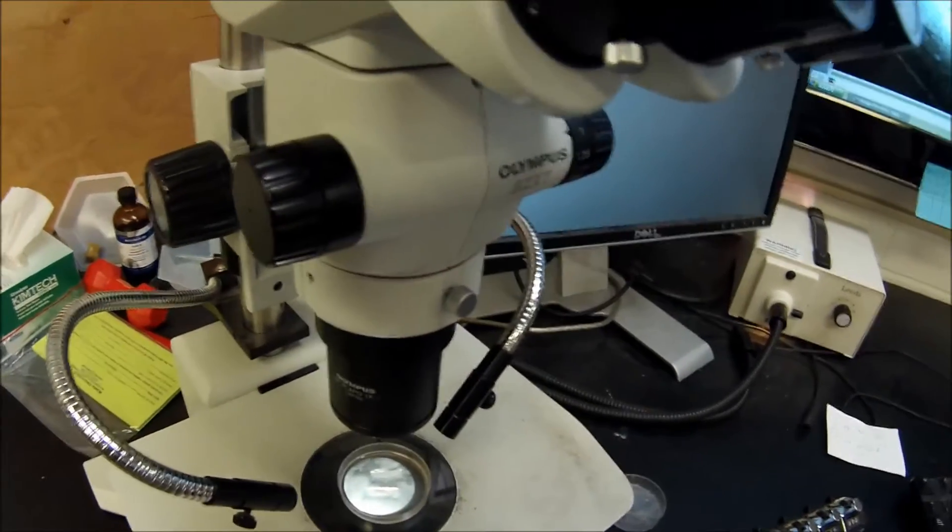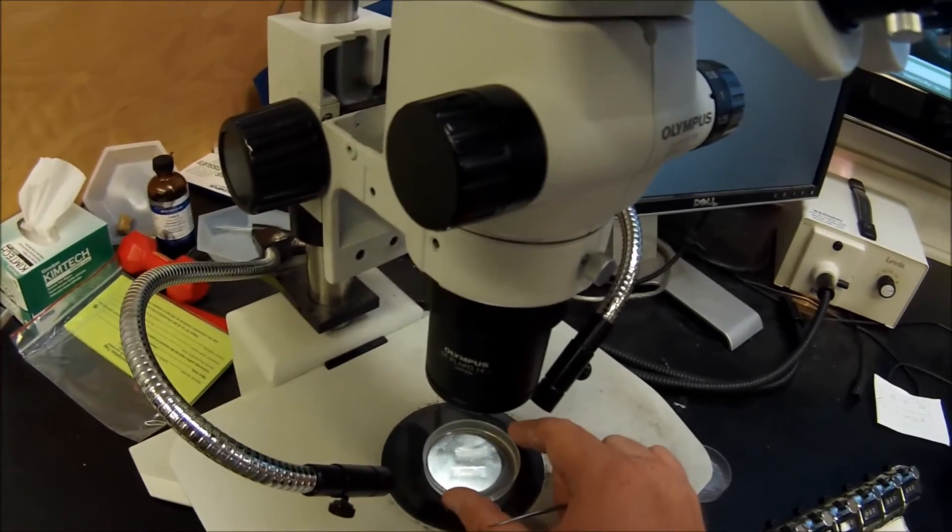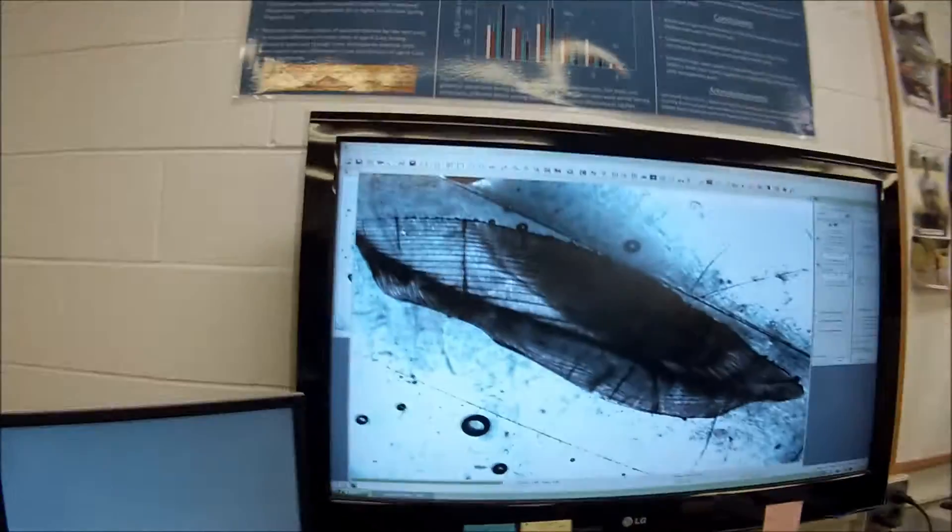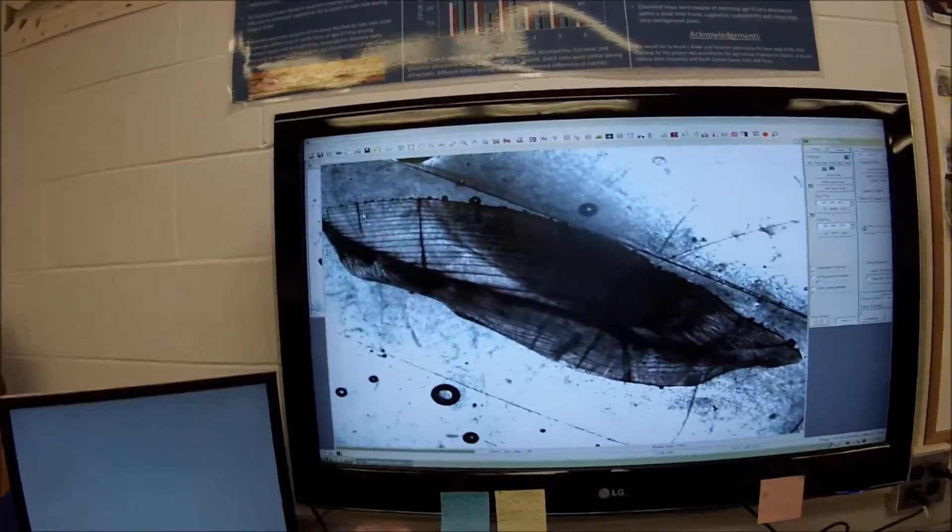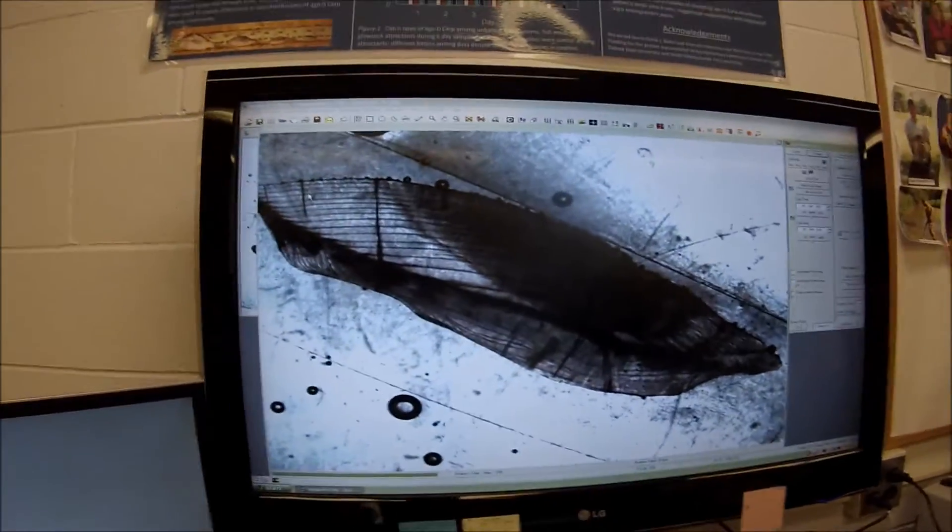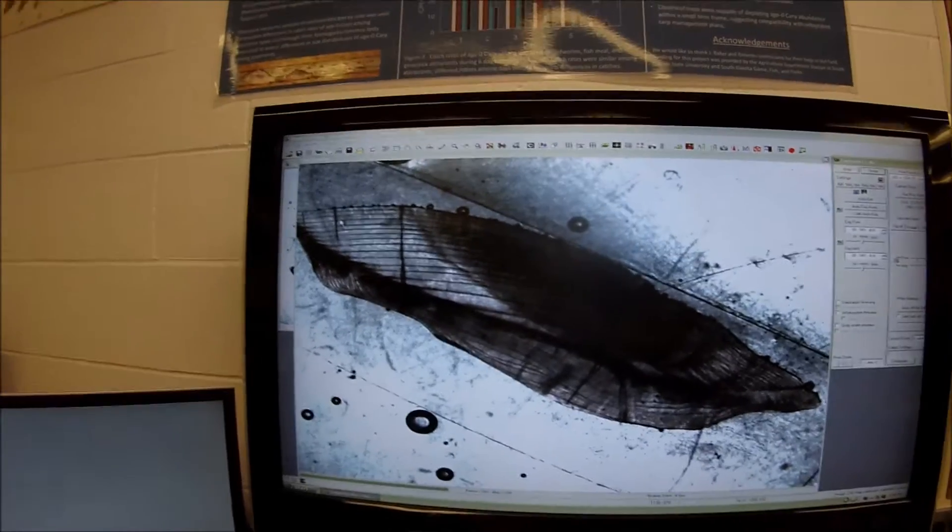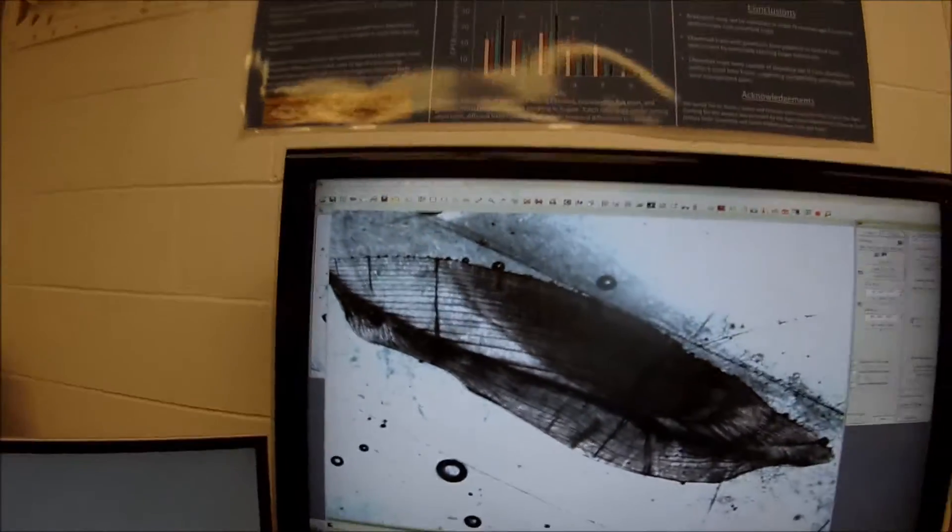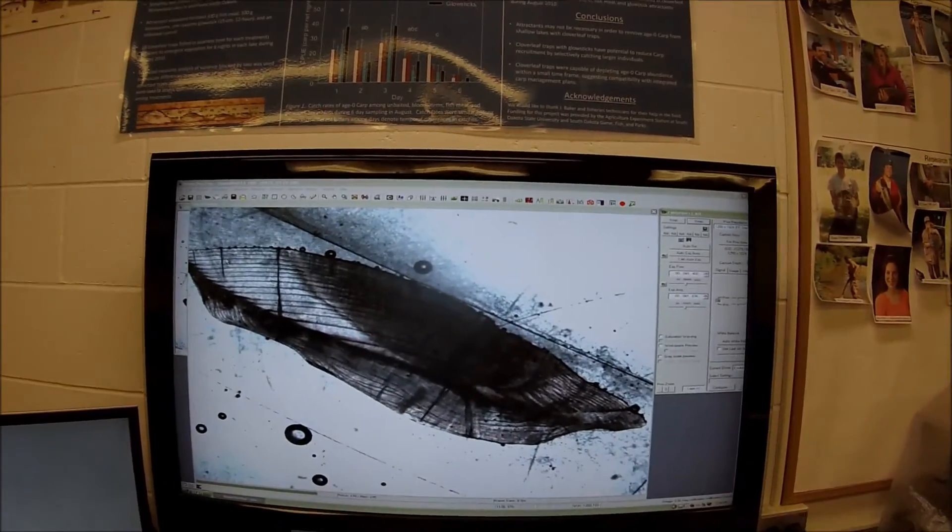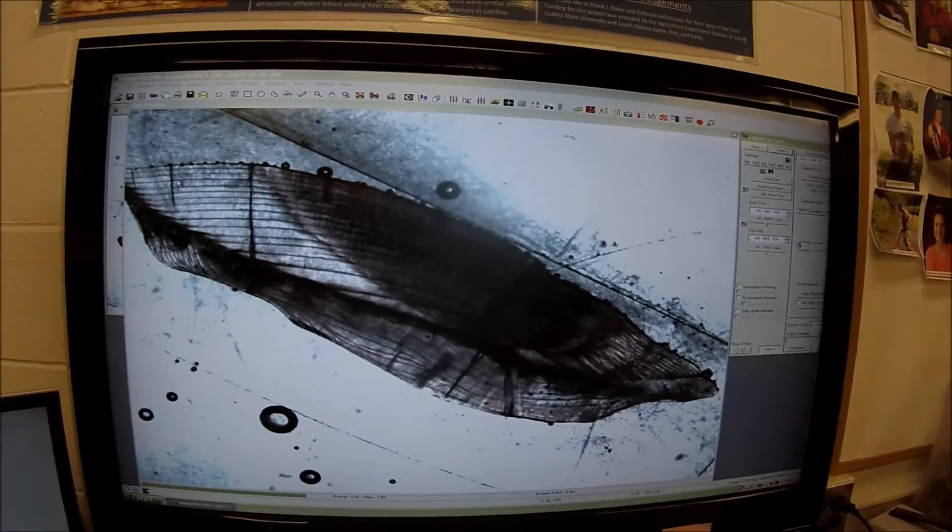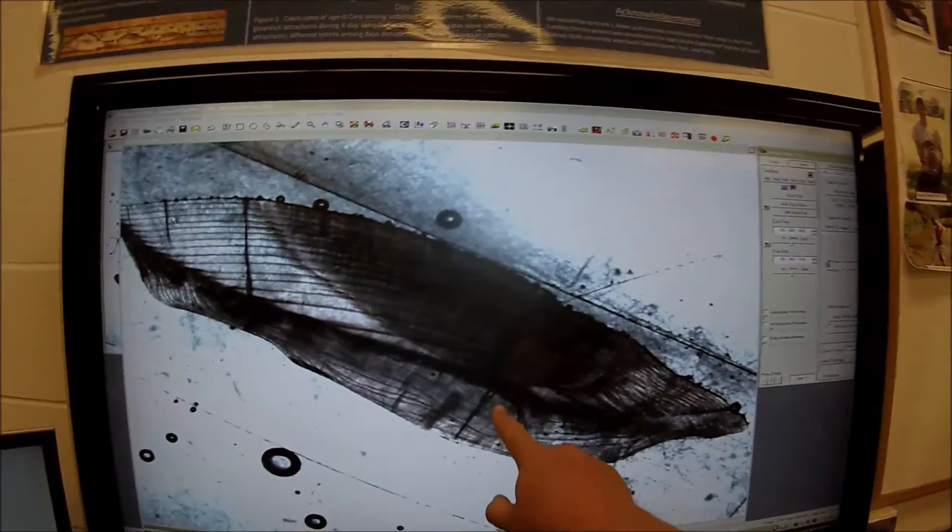And this very nice microscope is hooked up to a computer so that we can actually blow up the image so we don't have to squint our eyes into the microscope. So this is a very old fish here. We can adjust the light. It might make it a little bit easier for you. So this is the proper way to age fish, in my opinion. And you can see here, this is the nucleus.